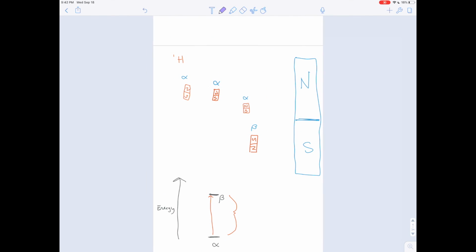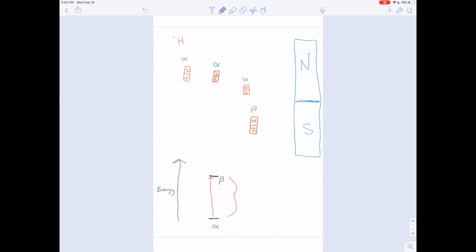Okay, well, where we are right now is we can tell whether hydrogen exists in a sample by applying an external magnetic field and shining radio waves through. And if the nuclei flip, if the hydrogen is there, it'll cast a shadow. The nucleus will flip and cast a shadow at the frequency of the wave that has the same amount of energy as you need to go from this alpha quantum state to the beta quantum state.